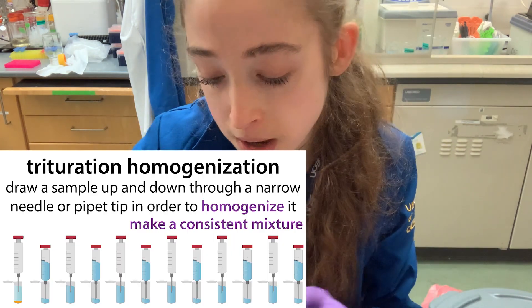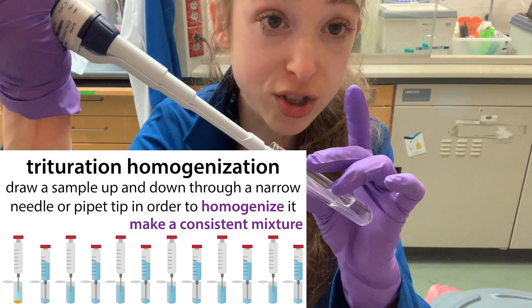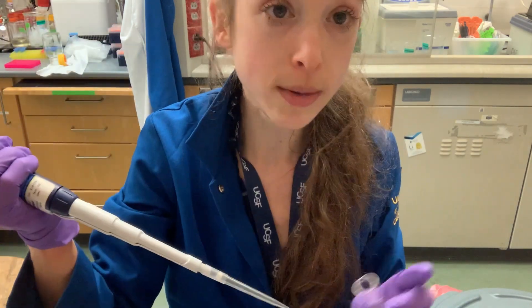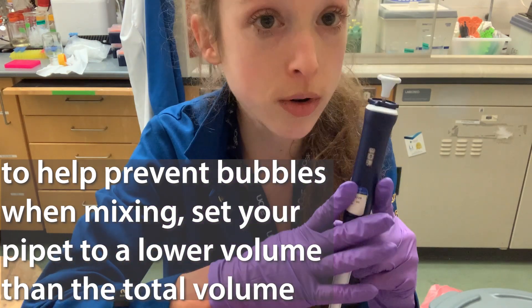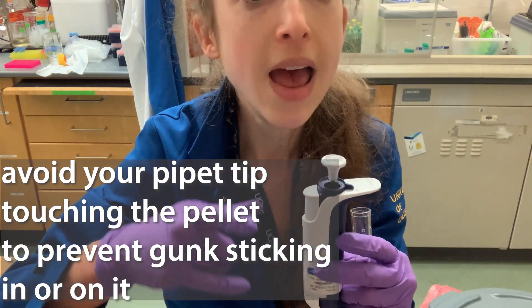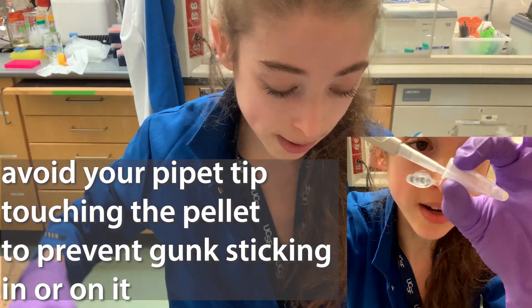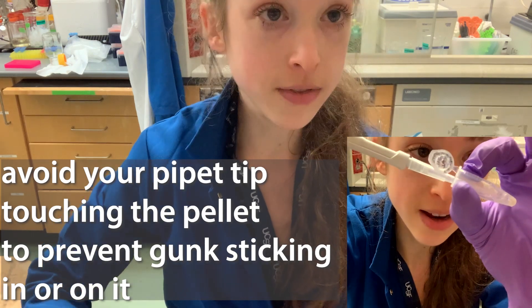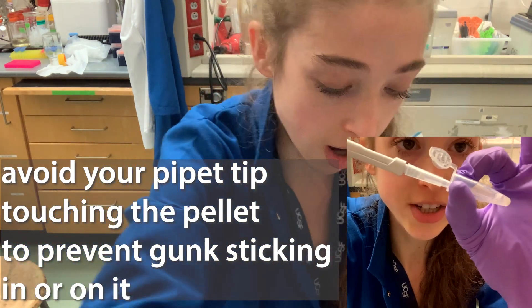So what you're going to want to do next is triturate them — basically pipette up and down. When you're doing this, it's really important to prevent bubble formation, so set your pipette to a lower volume than the volume in the tube so you don't introduce air. You also want to make sure that your pipette tip isn't actually touching the pellet. You want to be pipetting basically right above the pellet and give it kind of a vortexing effect of liquid on top.